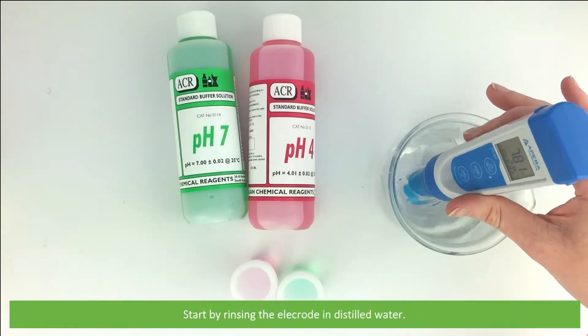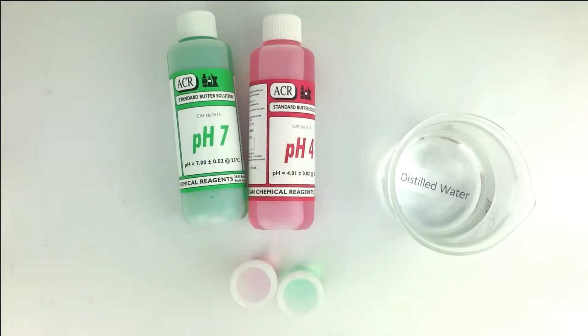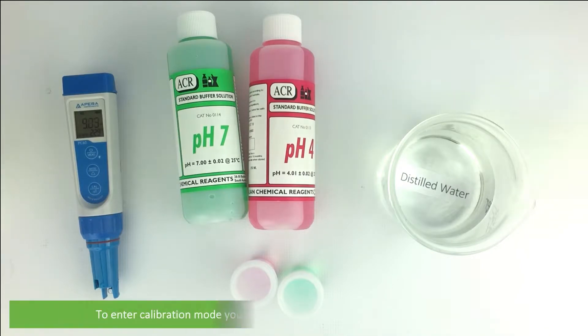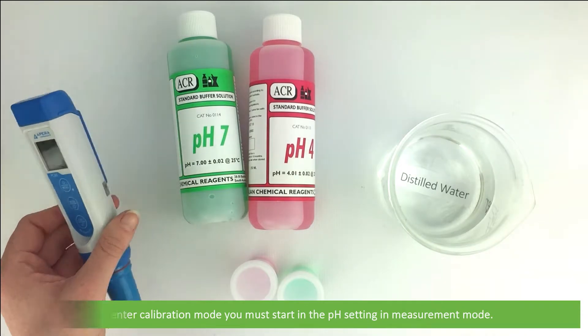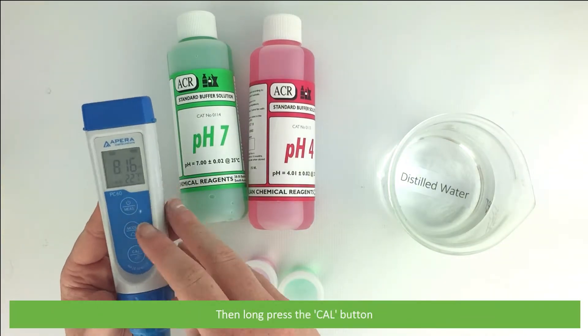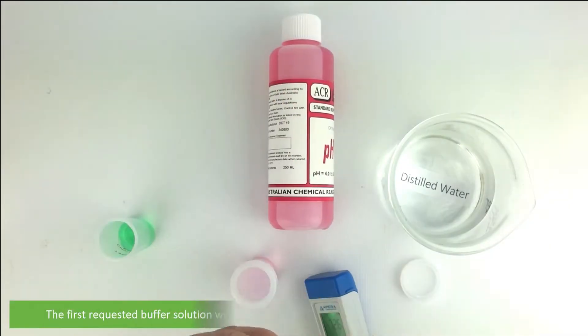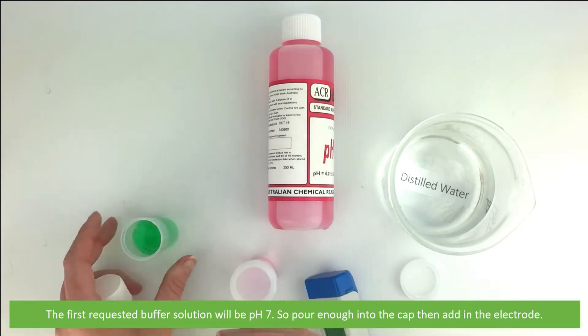Start by rinsing the electrode in distilled water. Then to enter calibration mode, start in the pH setting in measurement mode then long press the cal button. The first requested buffer solution will be pH 7, so pour enough into the cap and add the electrode.